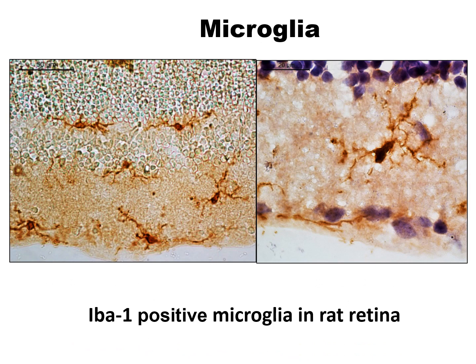Similarly, oligodendrocytes and microglia are stained with some antibodies. Here, see the oligodendrocytes and the microglia. The microglial processes are very small. It looks like a spider with its legs.